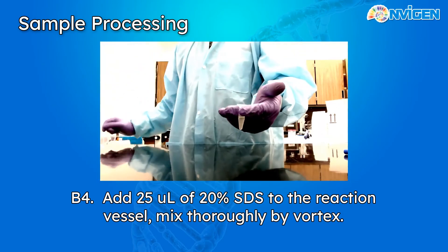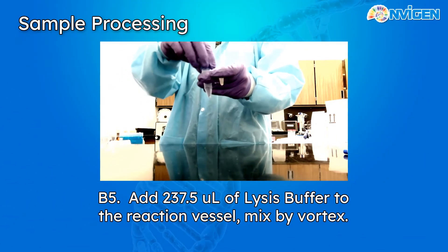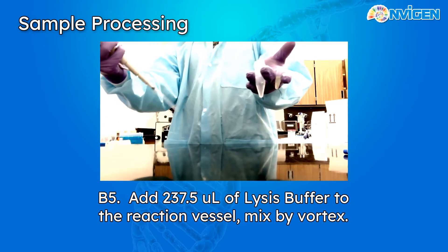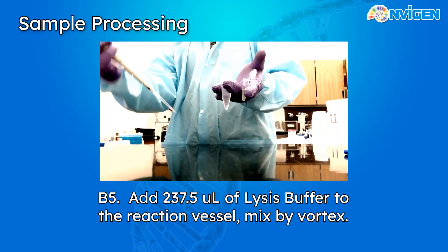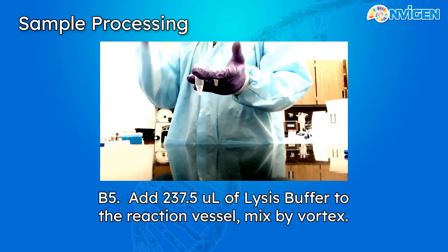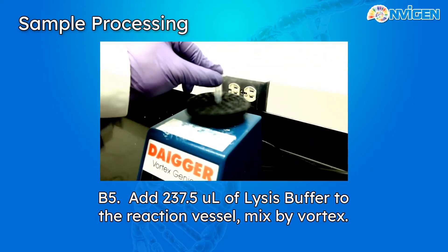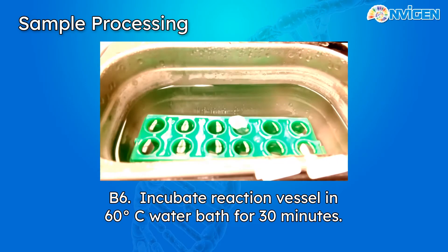Finally, we're going to add our lysis buffer, taken fresh from our water bath and mixed to ensure a homogeneous solution. Add 237.5 microliters of the lysis buffer. Overall, these reagents will serve to denature and break down the proteins in our plasma sample. Vortex thoroughly, then immerse your tube in the water bath and allow it to incubate for 30 minutes.